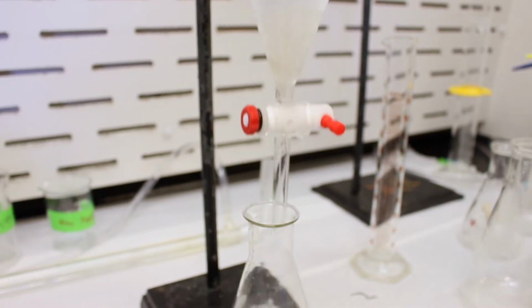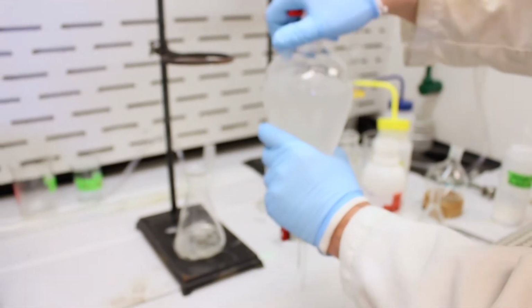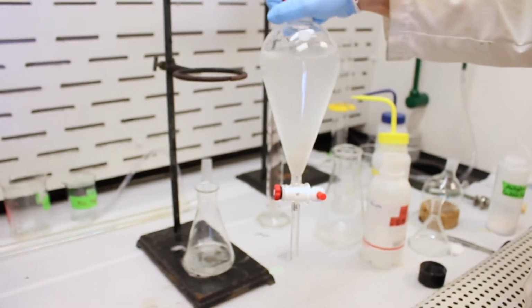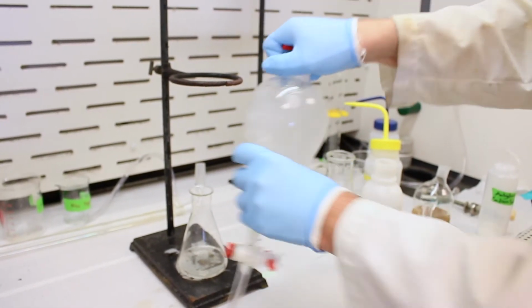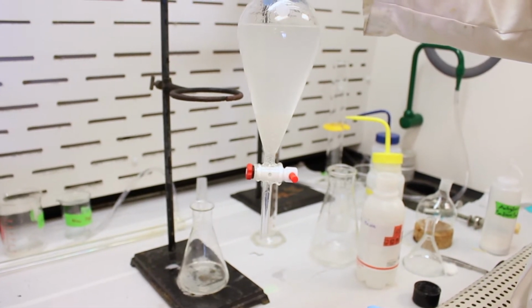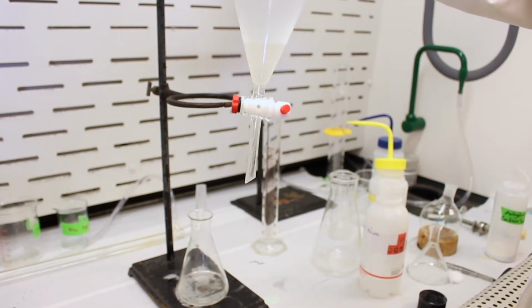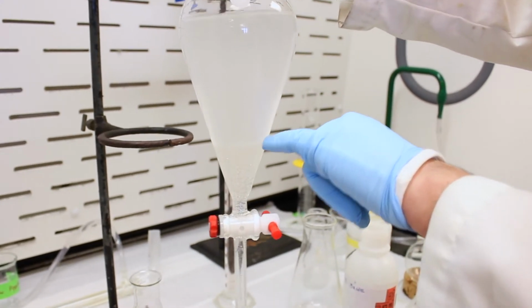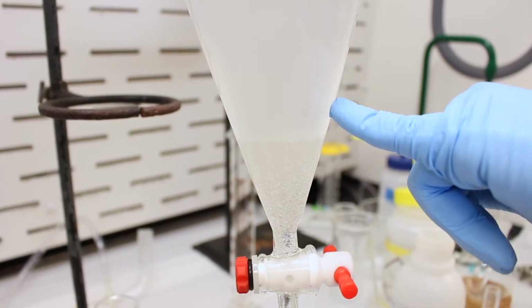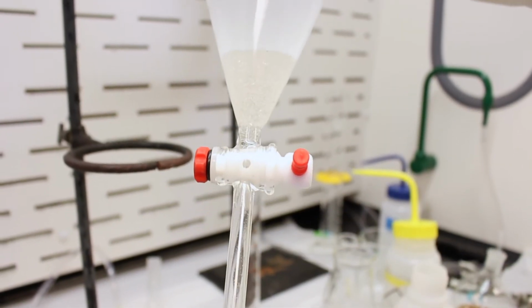Okay, so maybe we can try to swirl it a little bit to try to get that last bit of emulsion resolved here. Yeah, so you can kind of see where the interface is here, but some of the water just doesn't want to go back to the water layer, so that's why we see some bubbles in here.